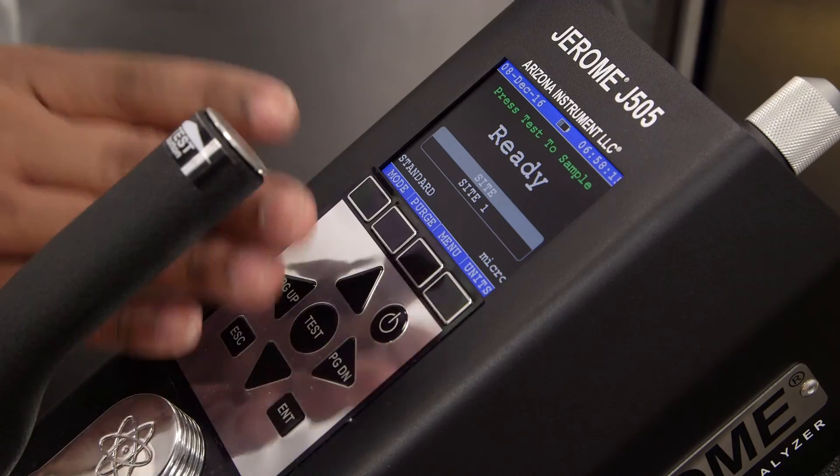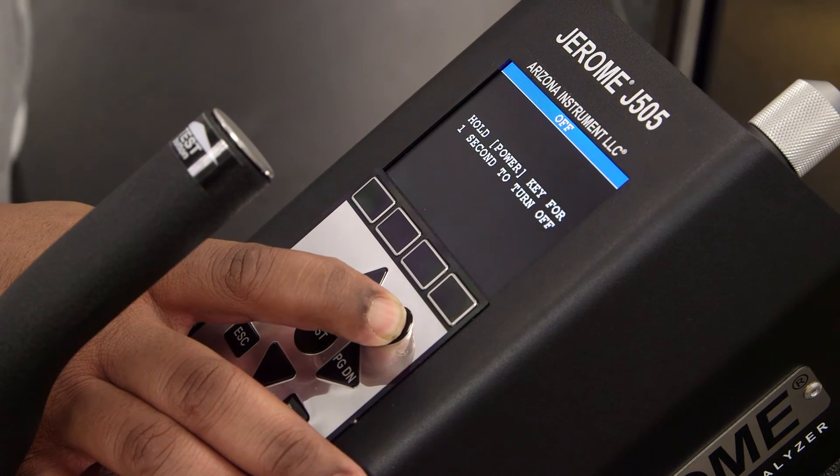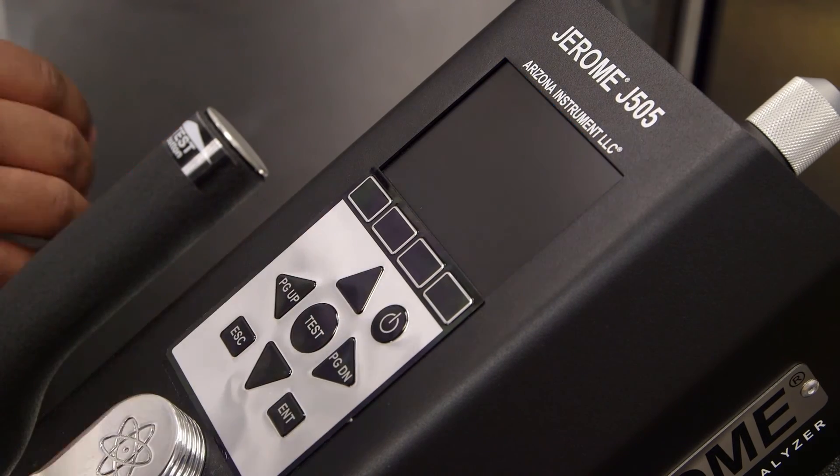After a day's use, press and hold the power button to power down your instrument. Make sure to charge your Jerome after each use so that it's ready whenever you need it.